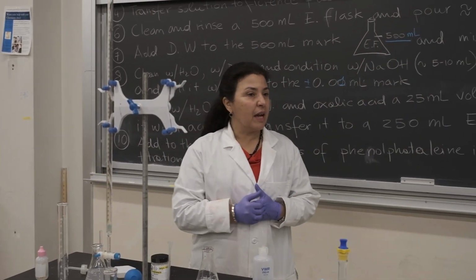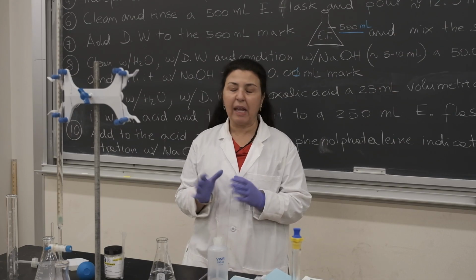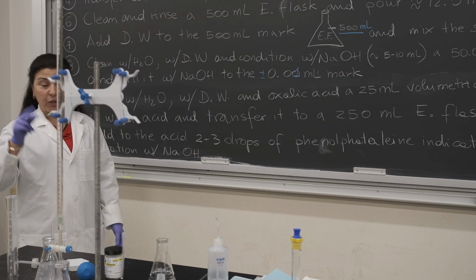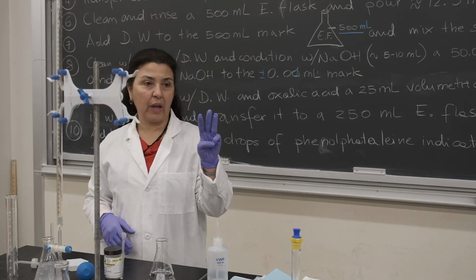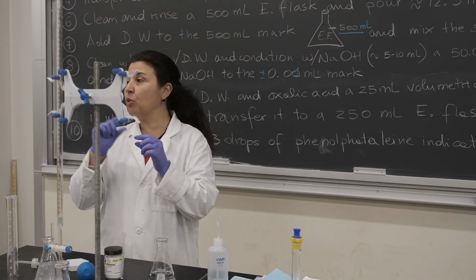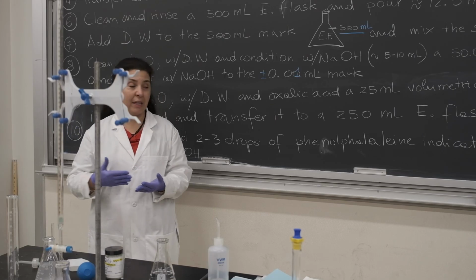Every semester, I have a competition in my class. Those of you who get the lightest pink solution, sorry, not the pinkest, the lightest pink solution, will get extra credit for this part. We have two portions of extra credit. Once we do at least three titrations, you have to do a minimum of three, or as many as you need to reach precise volumes. The volumes have to be close in value to each other. That means your titration was pretty precise because you have repeatability, right?